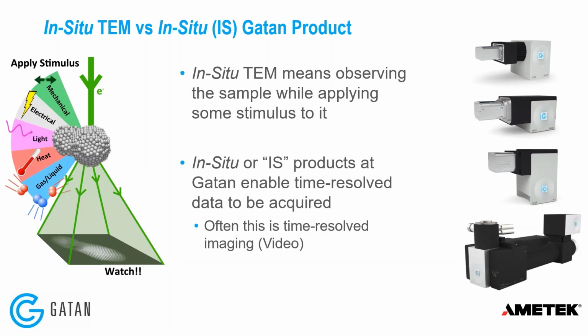So in-situ TEM really means observing the sample while applying some stimulus to the sample. And so you can see here on the left of my screen a figure that I produced in my PhD to illustrate this concept of in-situ TEM. And probably I would expect many or all of you who are listening into this webinar are quite familiar with in-situ TEM. But within Gatan, what we mean by an in-situ or IS product at Gatan is one of our products that enables time-resolved data to be acquired.